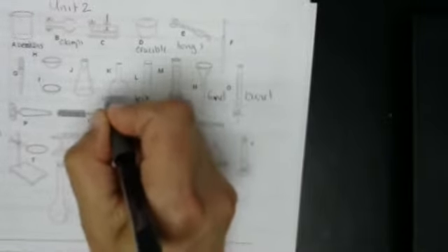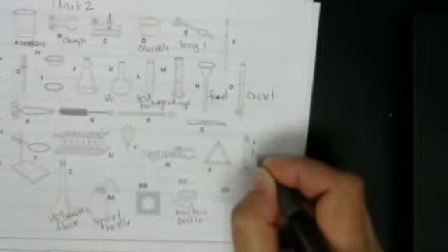Let's see, what do we have? A volumetric flask, or this one could be a volumetric flask too. It's probably better, it's labeled. Just a little squirt bottle down here. We used those a couple times. A mortar and pestle. And we have a Bunsen burner, which I don't like to use because, you know, I don't trust you guys in fire.